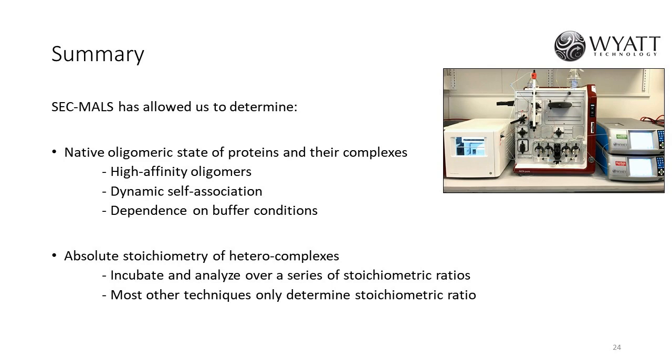Yes, oligomerization is concentration dependent. The entire study was done at 20 micromolar of protein, which is the lowest concentration at which the SEC-MALS gave us the best signal to noise. And yes, concentration would affect the study for sure, because if we went into a higher concentration range, the NAP protein would oligomerize because of its concentration-dependent oligomerization. Whatever the titrations were, they were all done at the same concentration.